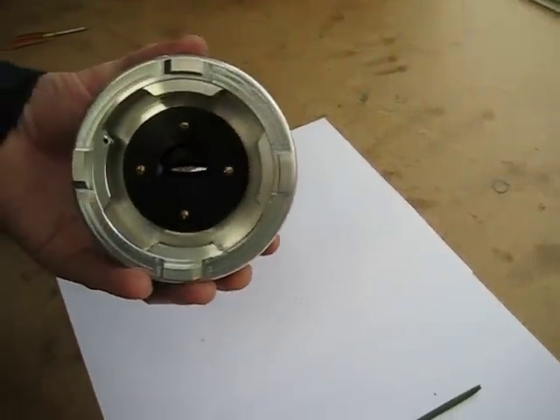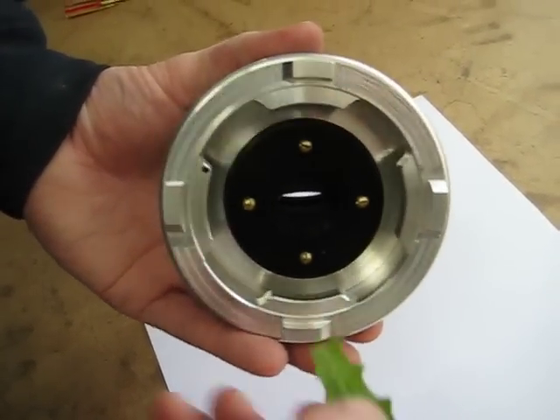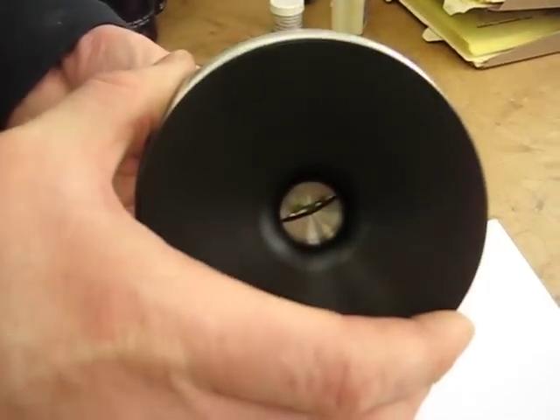Just grab that cut sample and thread it right through the little hole. Then turn it over and make sure that the samples pass all the way through the gasket and insert.